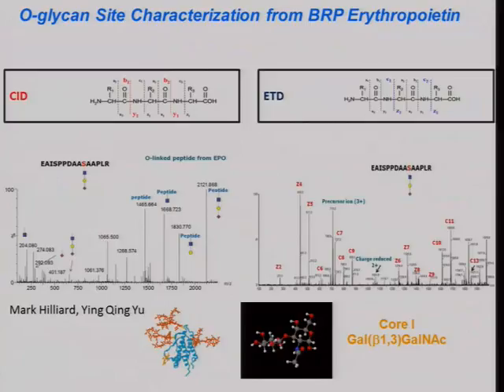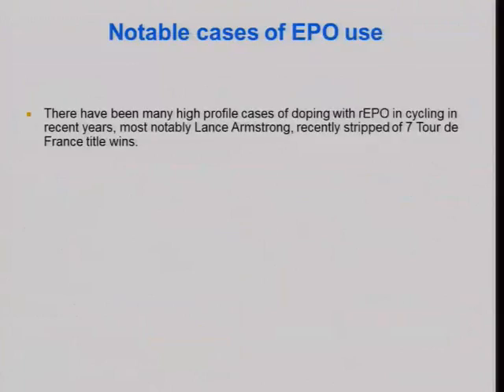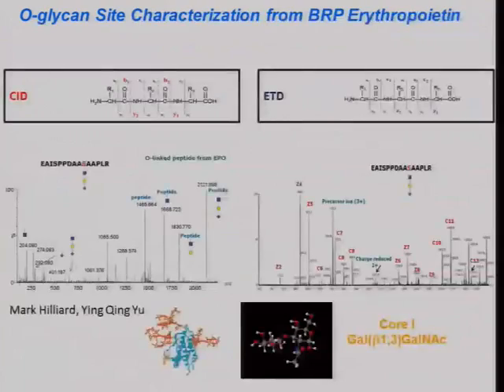I'm not going to have the time to show you, but etanercept has an enormous number of O-link glycans, 2 domains with 13 O-link glycans on each. So using a combination of CID and ETD, you can decide which glycans are present on which site. So that's a state-of-the-art paper we did with Waters. I think there's probably only one other paper that's attempted to do that. So that's where the cutting front edge is in all of this work.